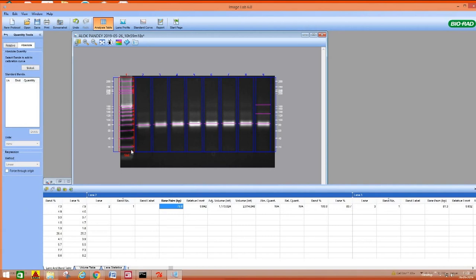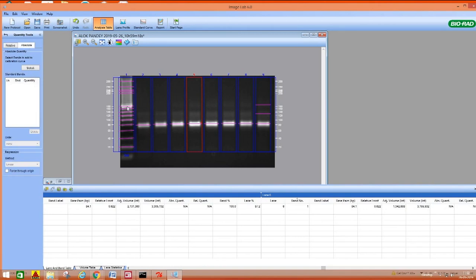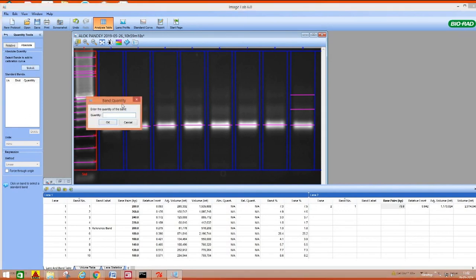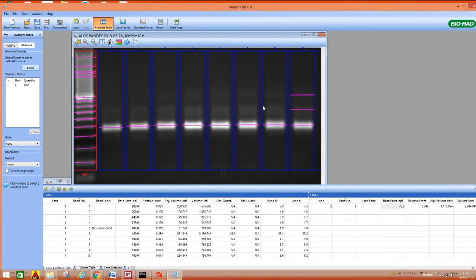And the other part is quantity tools. You can quantify the DNA also. So here also same as in case of protein analysis, relative. So you have to select one band. Suppose I'm selecting this one. Based on this, it will calculate all bands' relative intensity, relative quantity. Or you can select a band, standard one, and this is quantity. This band quantity, I'm saying it is 30 nanogram.